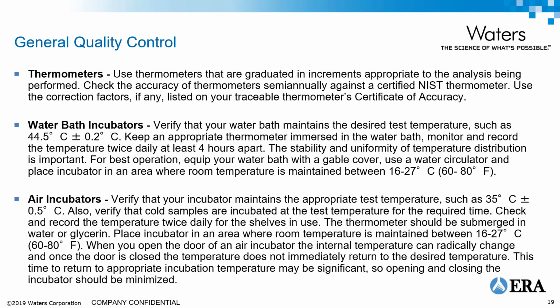Air incubators. Again, you need to be verifying the temperature is within the appropriate tolerance. Things with air incubators that you want to be aware of as well. Different shelves in the air incubator potentially can have different temperatures. You want to make sure that it's fairly uniform. Large incubators of this type can have some problems.